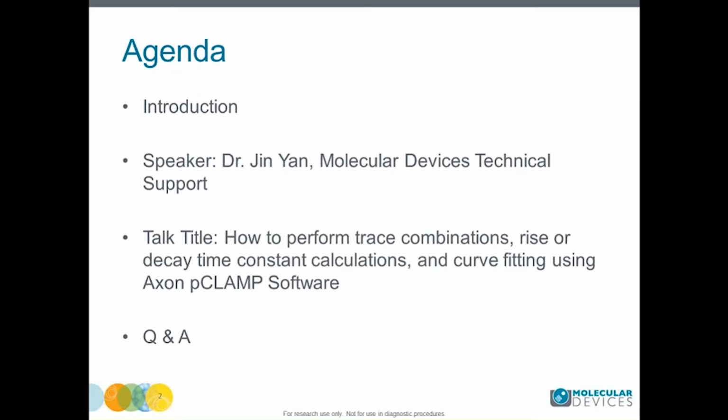I'm very excited today to introduce Dr. Jin Yan from Molecular Devices. Dr. Yan will be highlighting using Clampfit in pCLAMP to perform trace combinations, rise and decay calculations, and curve fitting. Then we will open up the floor for questions and answers.